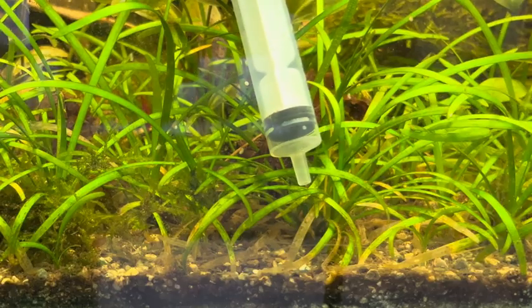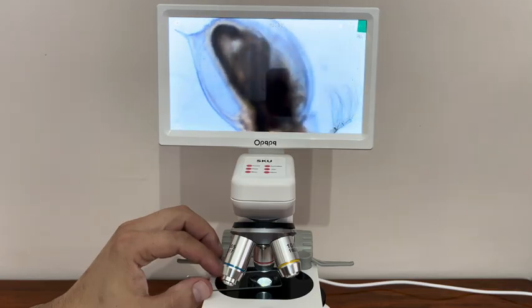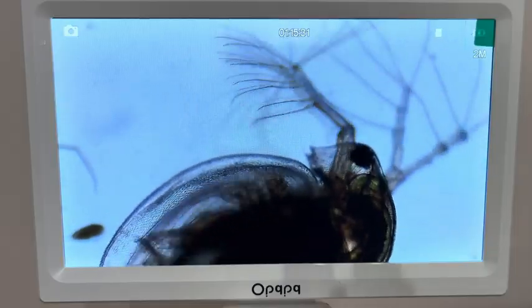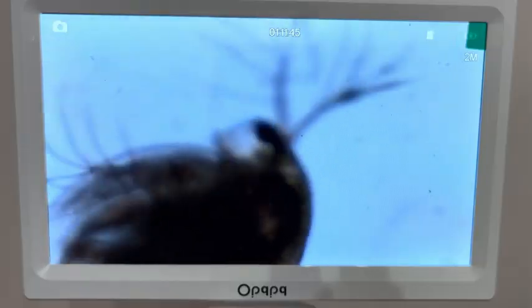Let's examine Daphnia, which are somewhat larger than Hydra — they are my favorites at the moment. Daphnia, commonly known as water fleas, are small, transparent, freshwater zooplankton. Their bodies are typically divided into two main parts, protected by an outer shell. Most Daphnia species are too small to be seen easily, though their size can vary depending on the species. Daphnia feed on phytoplankton and other tiny microscopic organisms.